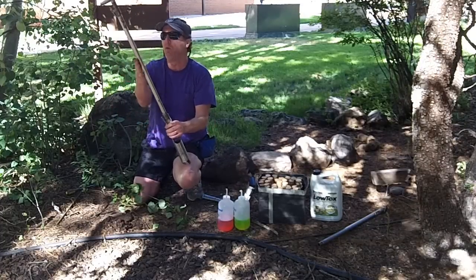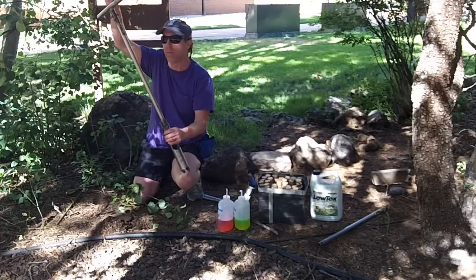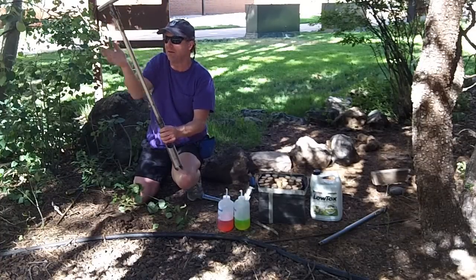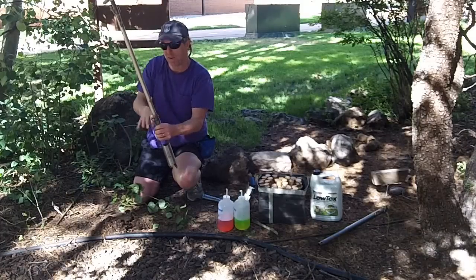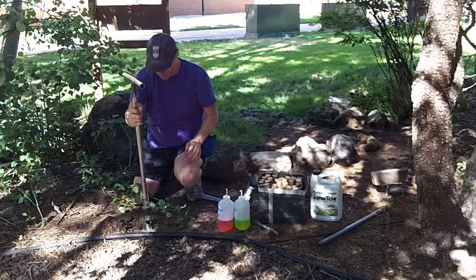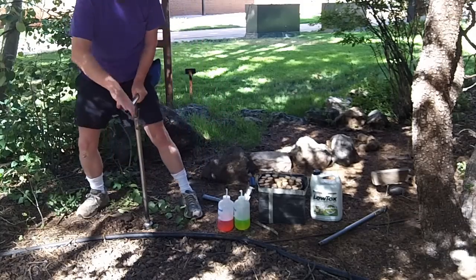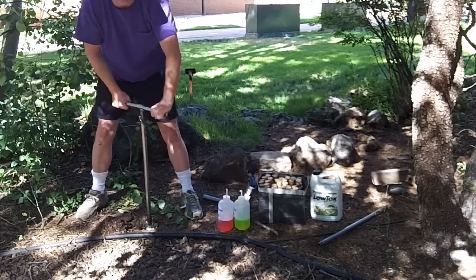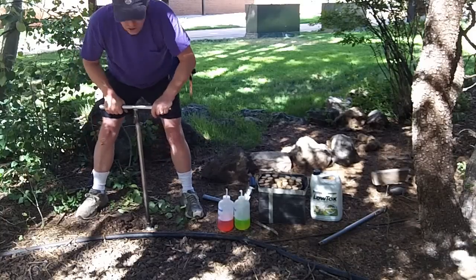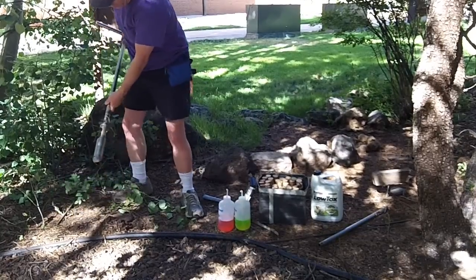I have one extension handle, and these all break apart and piece together. You can eliminate this, but it does make it kind of a small unit. I've already dug a hole here — I'll dig a little bit more just to show you. This makes it really fast and easy. In decent soil, you should be able to dig a hole within a minute.